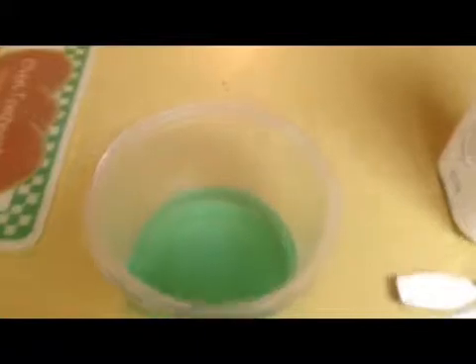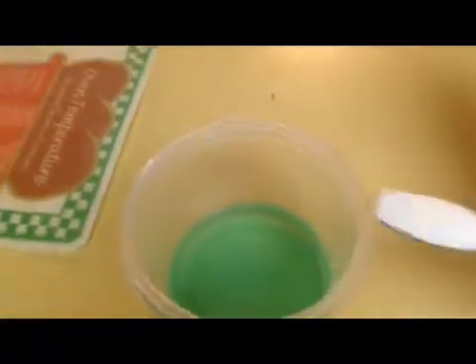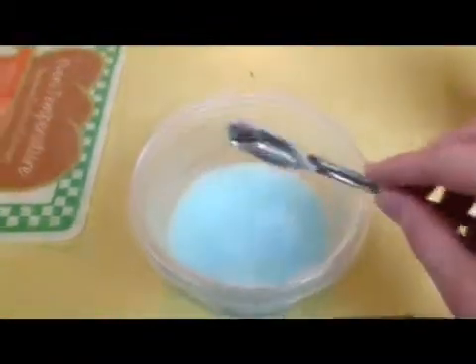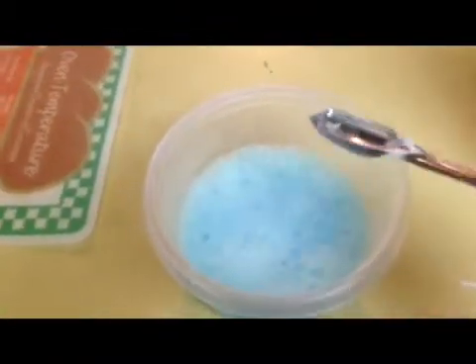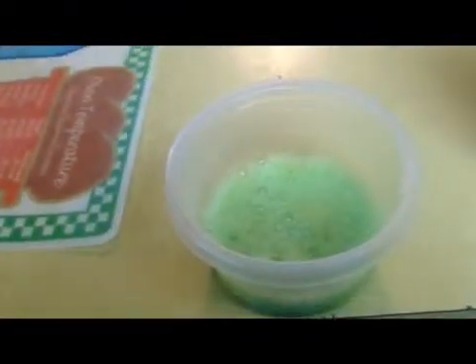What you want to do, it's pretty easy — you just take the baking soda and scoop it into the copper acetate. As you can see, it reacts. That's because there's vinegar in the copper acetate. And you see it's changing colors too, turning a greenish color.